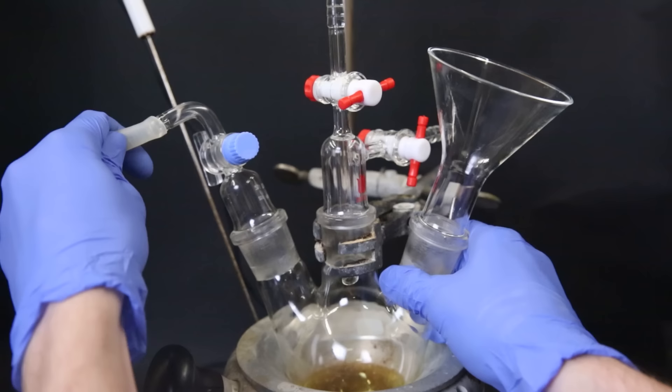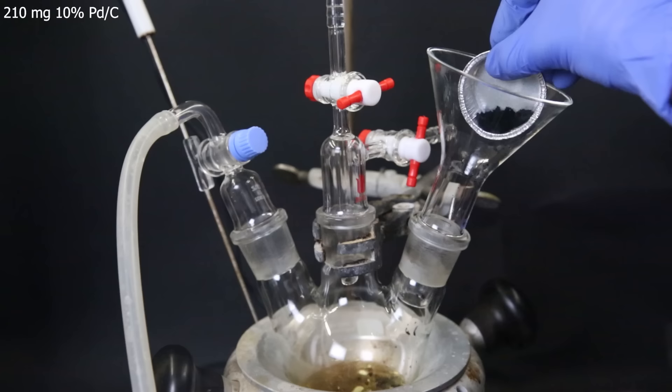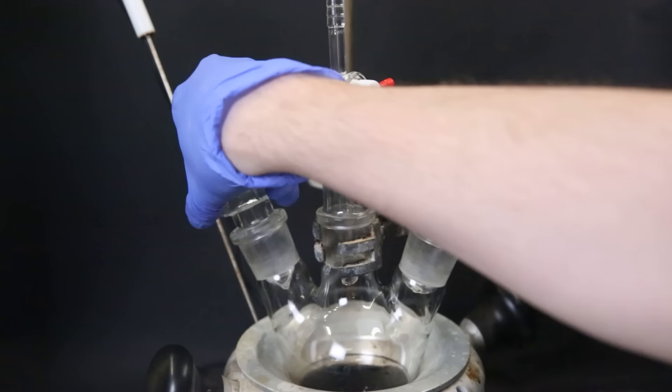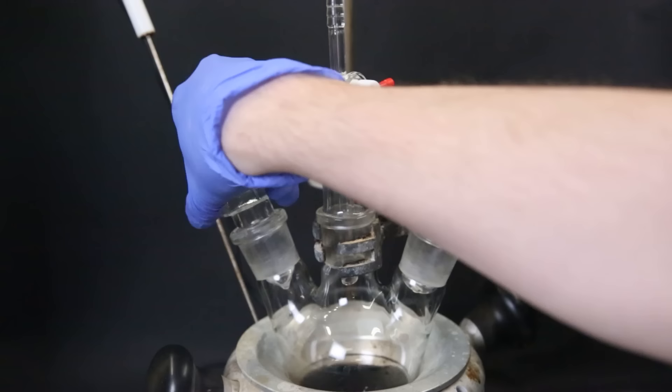I then attach an argon line and flush the flask with argon. Under argon flow, I add in 210 milligrams of 10% palladium on carbon, which will be the catalyst for this reaction. I then remove the funnel and replace it with a stopper. I also remove the gas adapter and also replace it with a stopper.